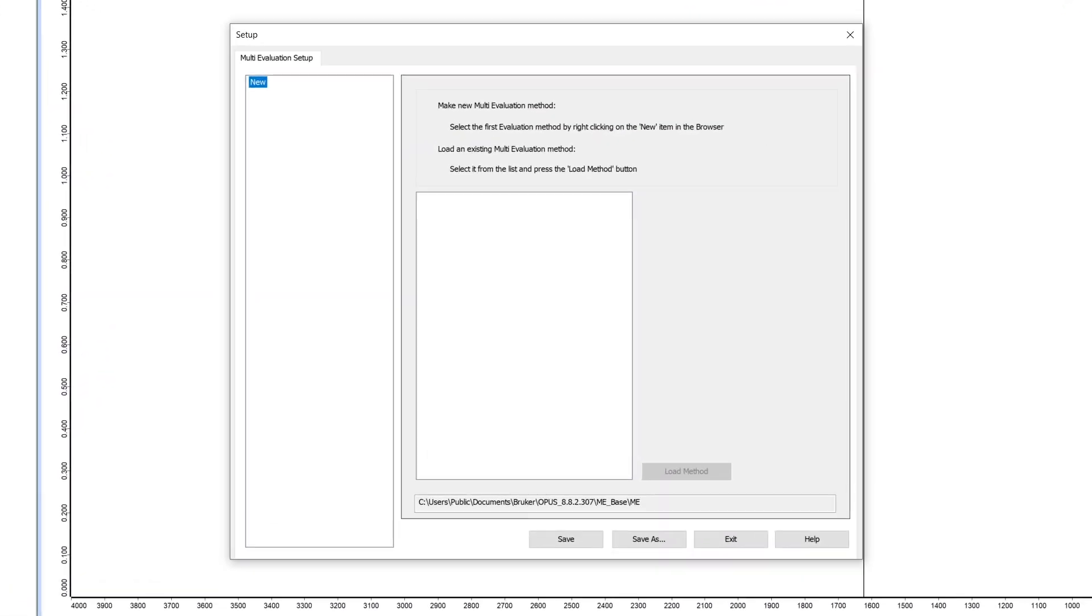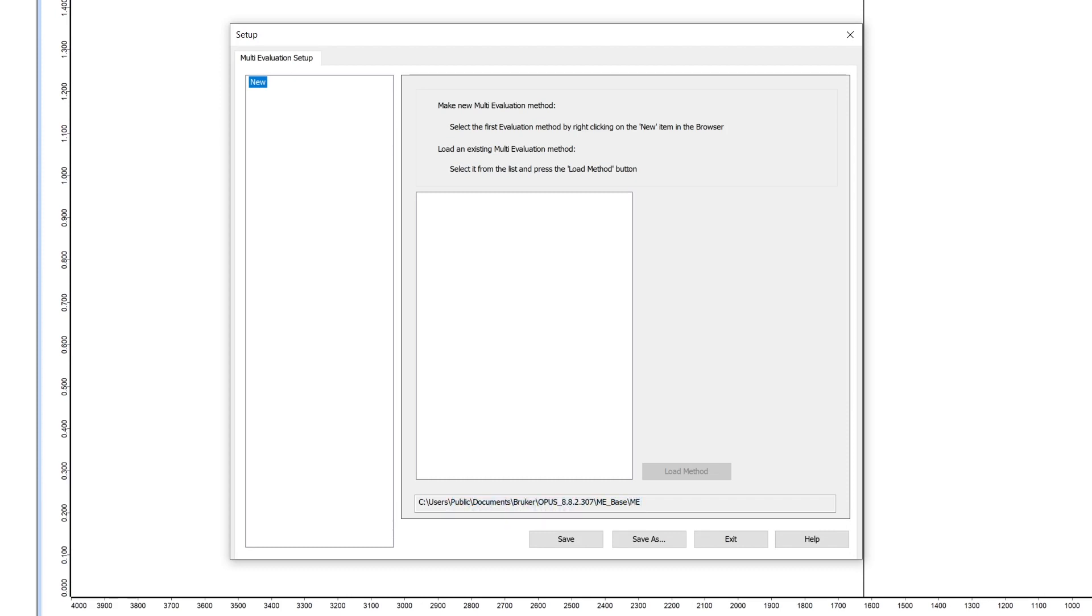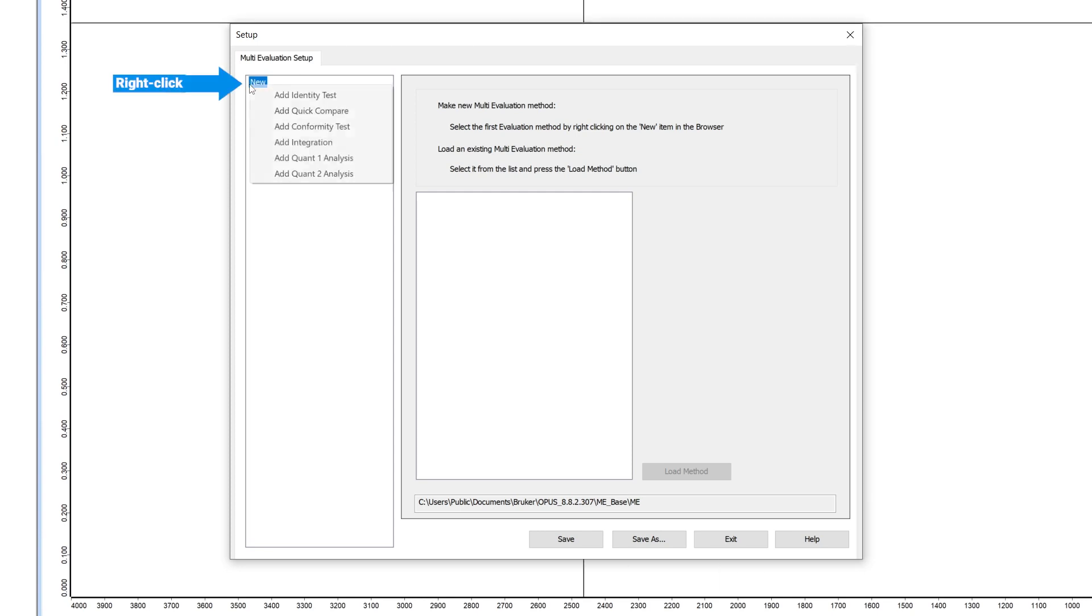In the opened window you can load all your existing MEVs to modify them. To create a new one, just right click on new and choose the method type you want to add.